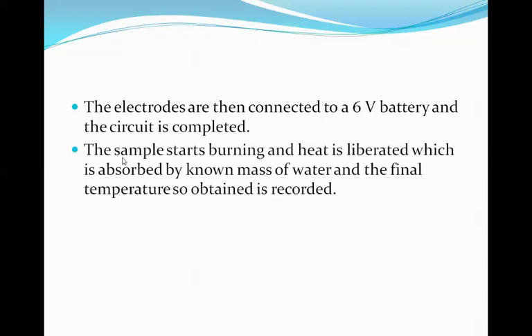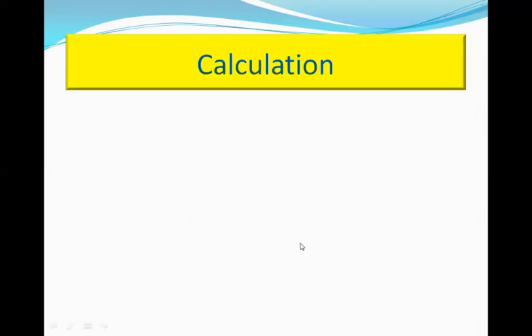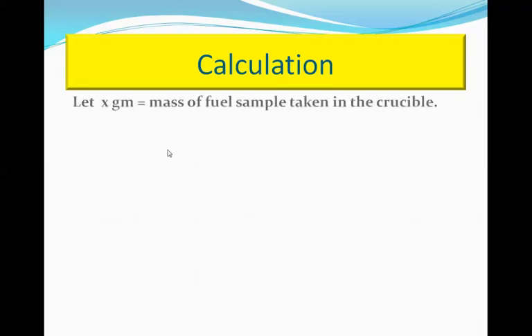As soon as the circuit is completed, the ignition takes place, the sample starts burning, and the heat liberated is absorbed by the known mass of water. The final temperature is then recorded. During the entire process, the stirring is continuously done so that a uniform temperature is maintained. Now, based on these observations, the calculation is carried out.